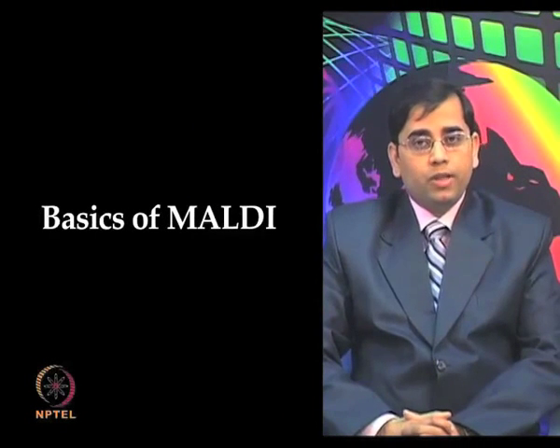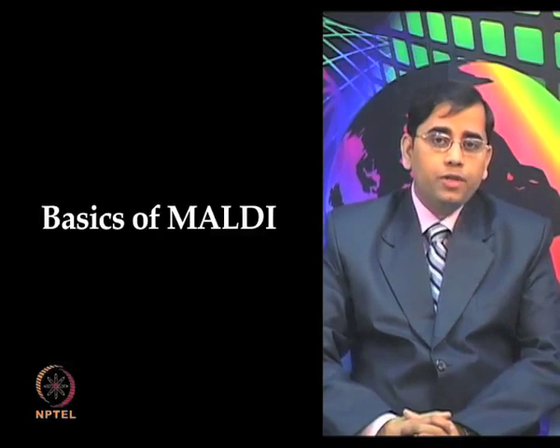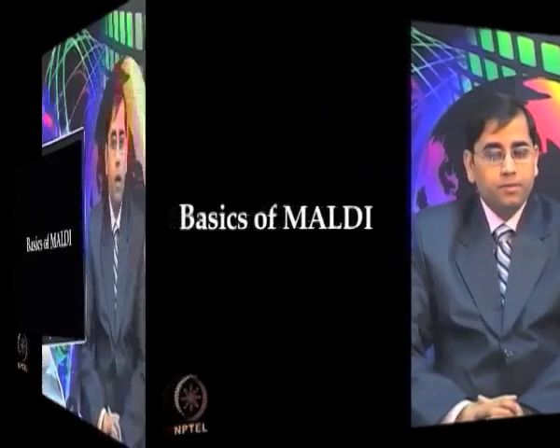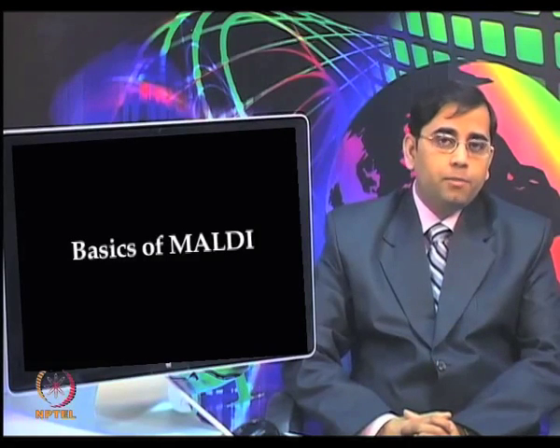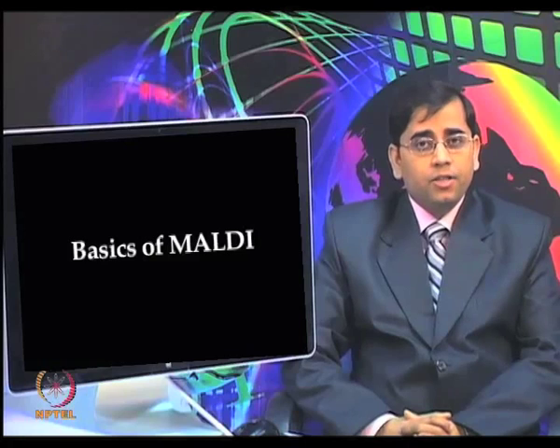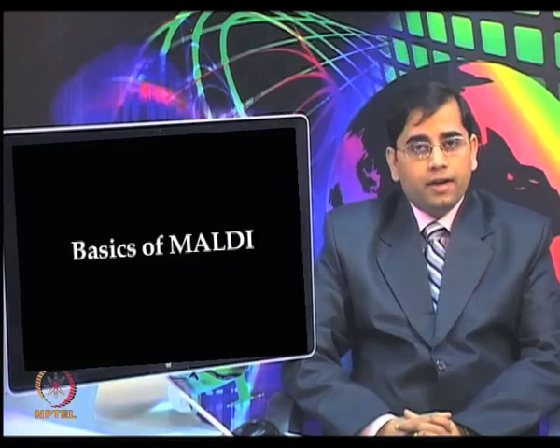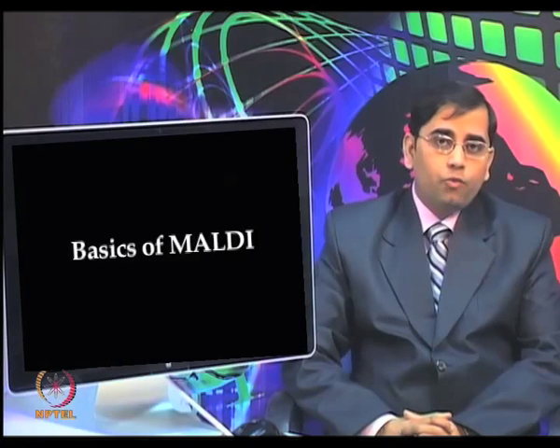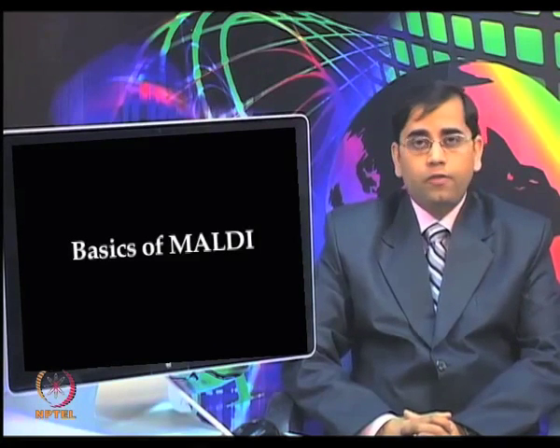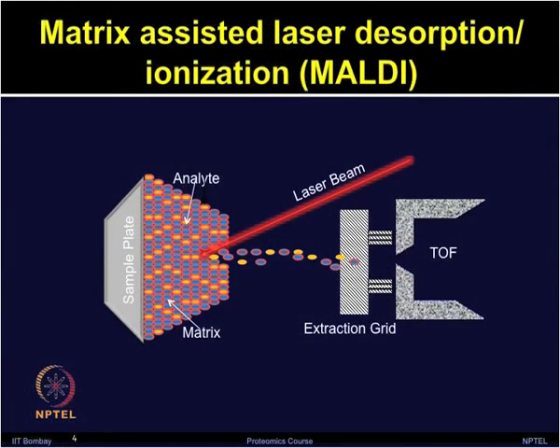So, MALDI is an efficient process for generating gas phase ions of peptides and proteins for mass spectrometric detection. MALDI is one of the most widely used ionization techniques currently applicable in the proteomics area. This ionization method was independently developed by two scientists, Koichi Tanaka and Franz Hillenkamp. Tanaka also received the Nobel Prize for his novel contribution to soft ionization techniques such as MALDI. Let us first talk about matrix assisted laser desorption ionization or MALDI.